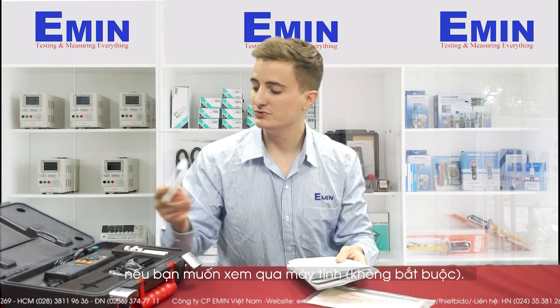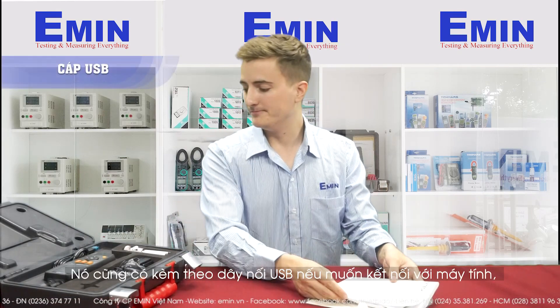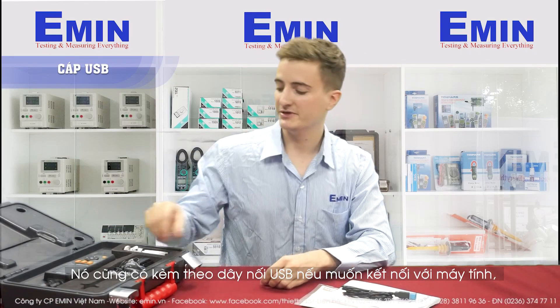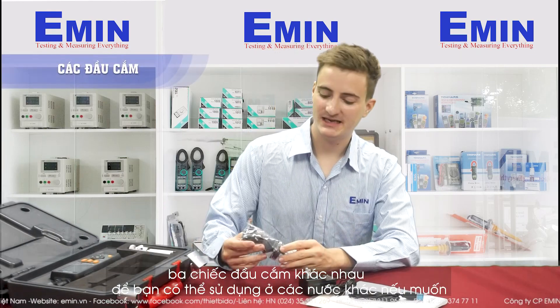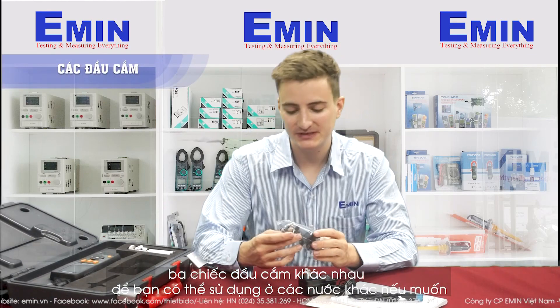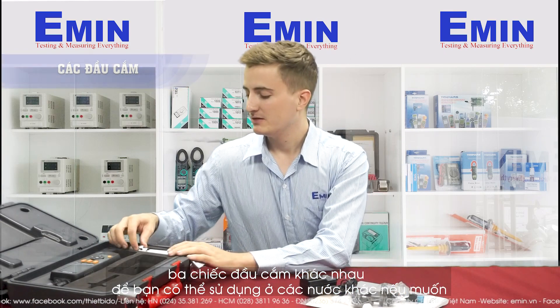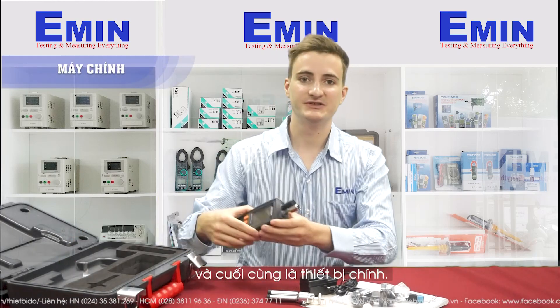If you want to connect it to a computer, you don't have to, but it also has a USB cable for that. There is a charger for the battery, and it has three different adapters depending on which country you want to use it in. The tripod and the device are also included.